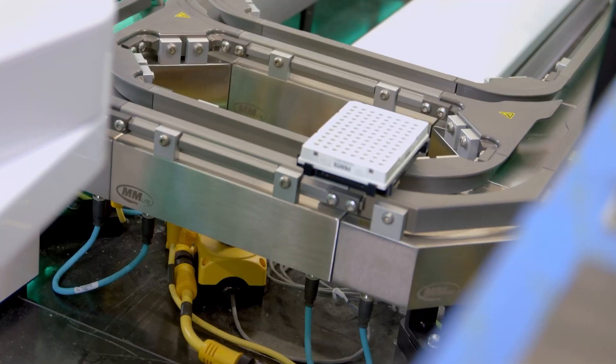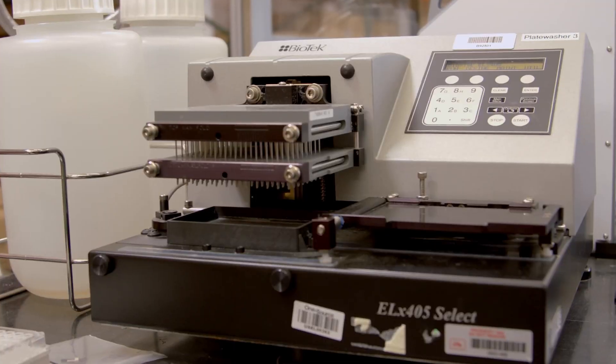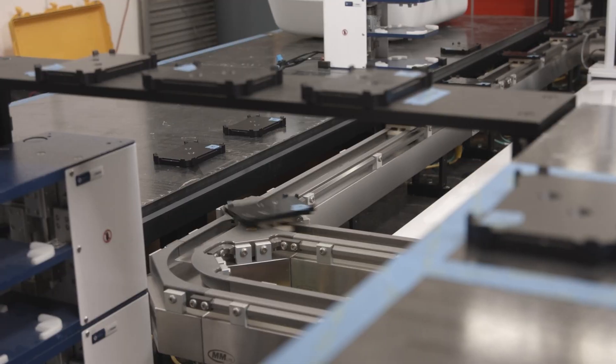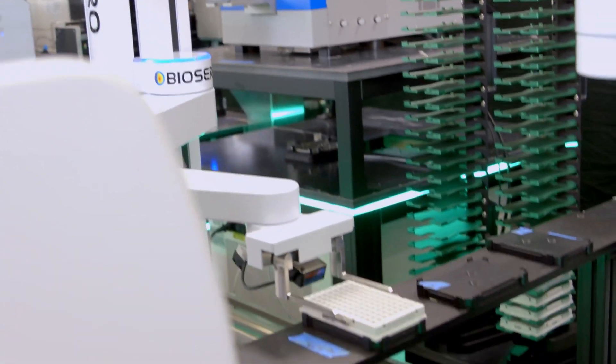Because BioSero's Green Button Go Automation Scheduling software is hardware agnostic, that means we can take any piece of hardware from any vendor and integrate it so that they can seamlessly communicate together to deliver the discoveries and diagnostics that are required for your laboratory.